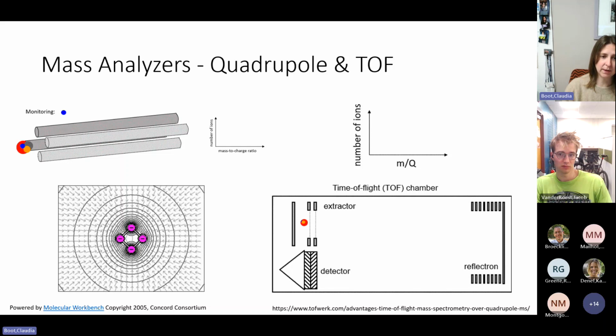And it's the shape of this electric field in the middle of the quadrupole that lets you focus these ions as they move through it. So you don't have to know anything about this. You just tell it, I want ions between 50 and 2000. And then the mass spec does all the work of adjusting these potentials for you to only see the ions that are between 50 and 2000. A quadrupole can also be very selective for only a single ion, if that's what you wanted to do, for different downstream applications. So that's a quadrupole.